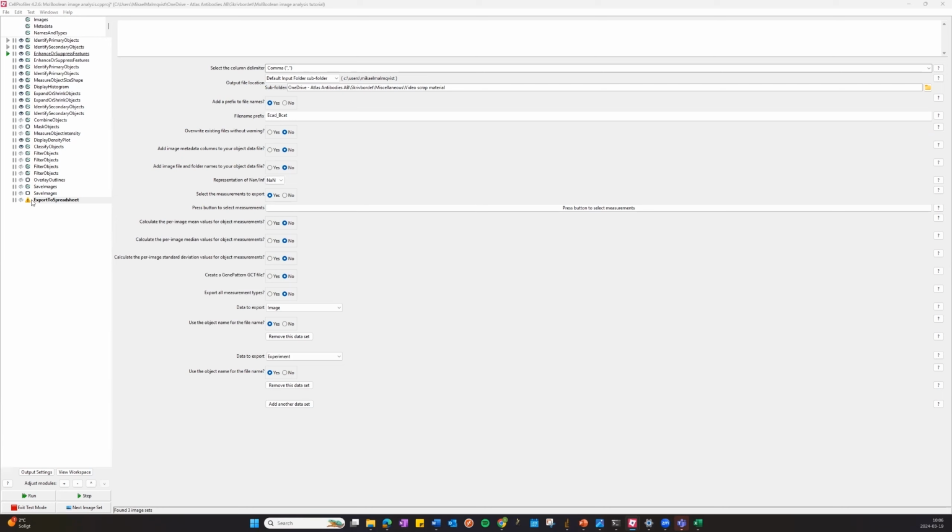And then the error message from here goes away, but you still have this exclamation mark, meaning that you can't produce output in test mode, it is saying. So now we've done these small alterations to the modules. We can go through the different modules in test mode again, from the enhance or suppress features onwards.